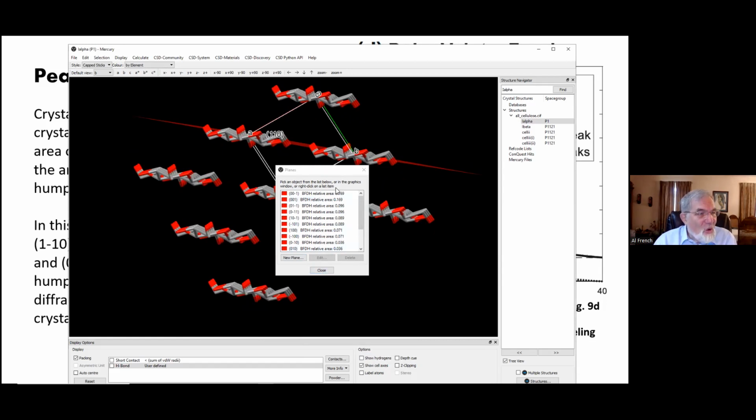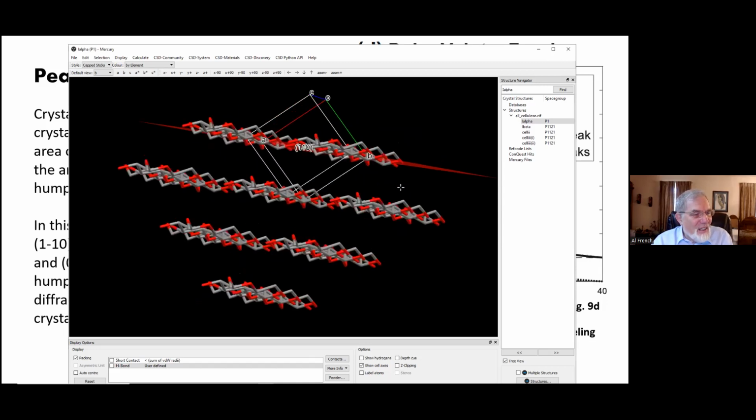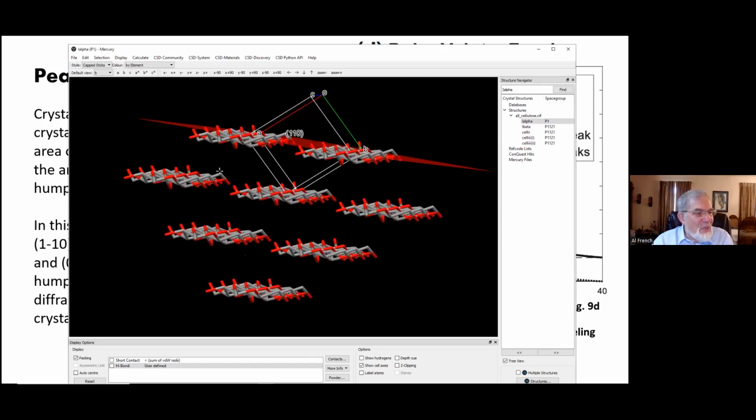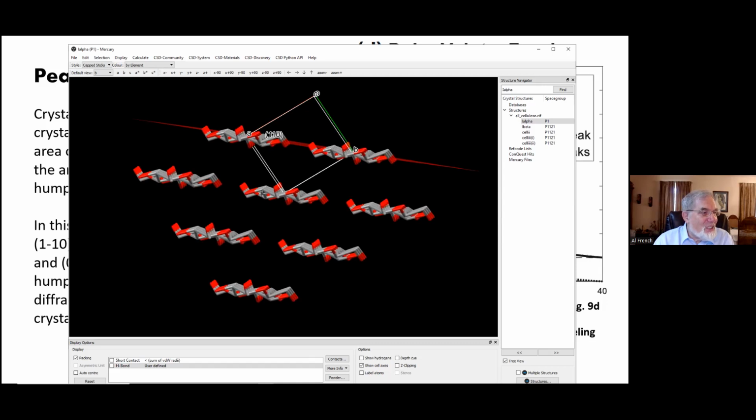So also, if you want, you can delete a molecule. Let's see, I'll close that window. We want to get this molecule gone. You just delete the molecule and it'll be gone. So this is actually an especially good example because of the P1 space group for cellulose 1 alpha. If you do these packing calculations for 1 beta with P21 symmetry, anything with P21 symmetry, you'll get fragments of the molecule as well as the long chains that you want. And so to get a nice picture of the crystal, you have to do some deletion. I'll let you figure that out from that point.